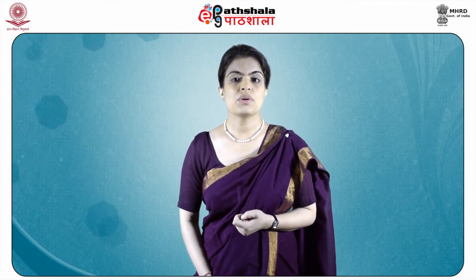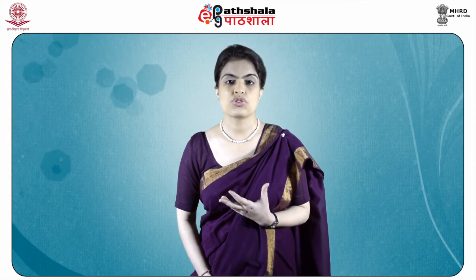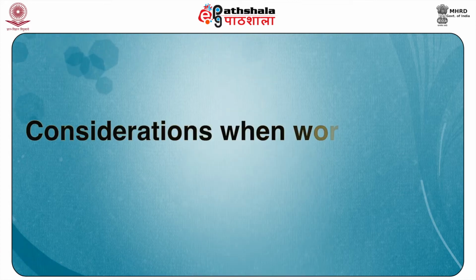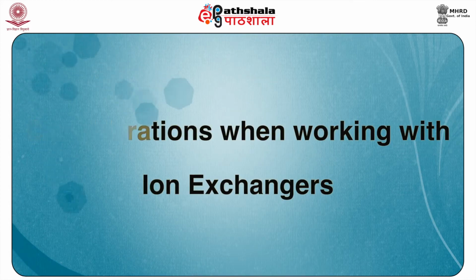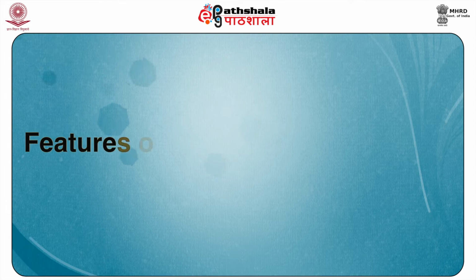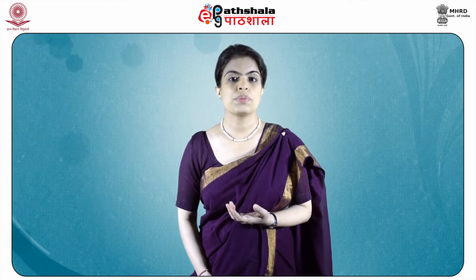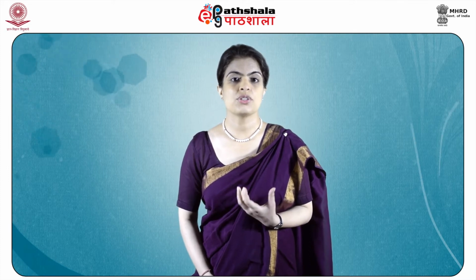Also, weakly bound substances will be eluted first, followed by substances bound more strongly. Affinity of a bound substance to the resin will be a function of both the pH and ionic strength of the buffer system used. Now we'll discuss the considerations when working with ion exchangers. Firstly, the features of an ion exchange resin. There are some important properties of an ion exchange resin that need to be taken into consideration when deciding to use an ion exchanger for separating molecules.